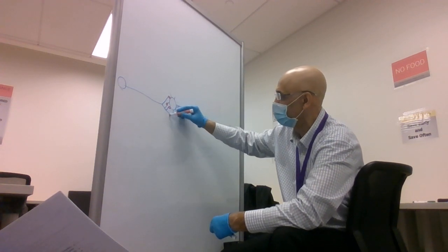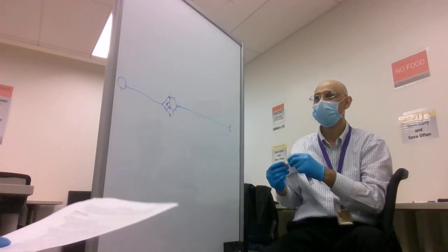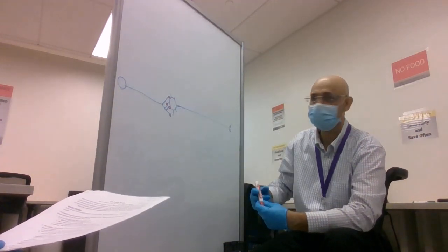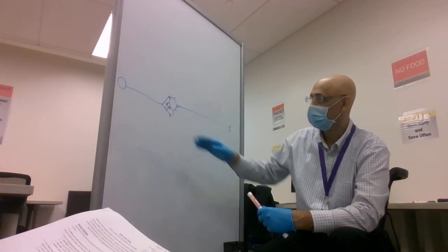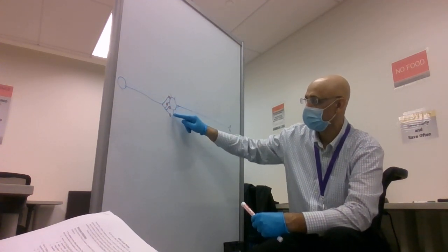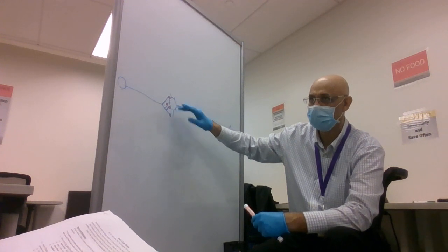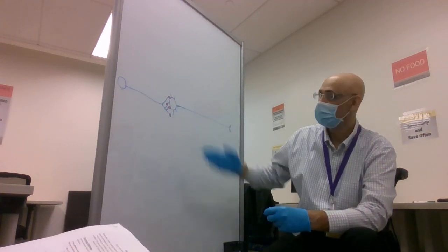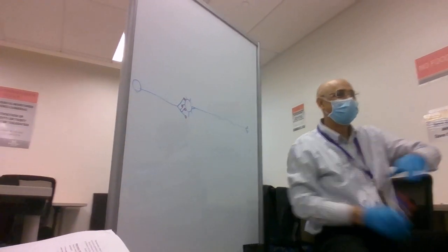Okay. So these red round structures are the axon terminals. Again, this is the presynaptic neuron. We did this in chapter 11: the action potential comes here, these release neurotransmitters, and gates open here, and a graded potential is produced, right? What about the vesicles? Vesicles are deep inside, so we cannot see them now.